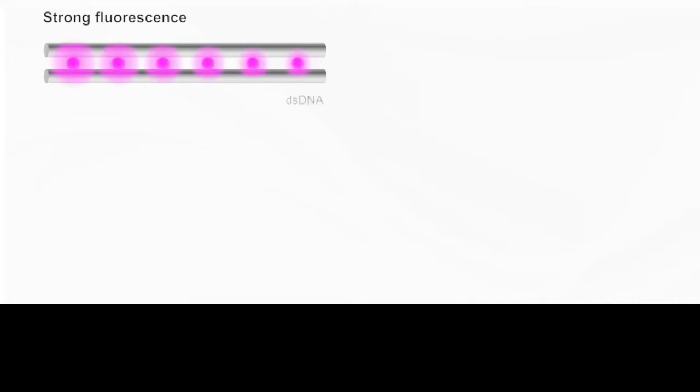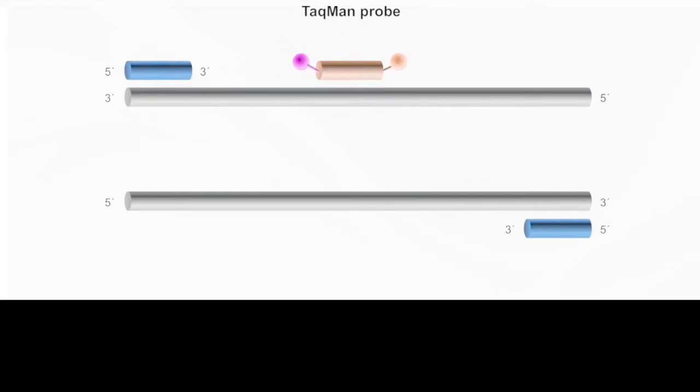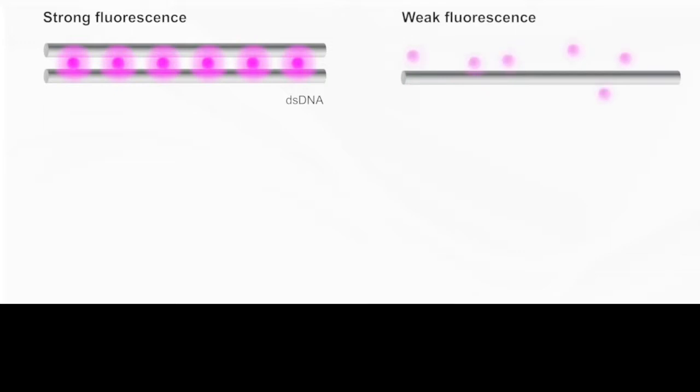So why would you want this kind of information? Well, for certain situations, for example viral infections, you don't just want to know whether the virus is present. Sometimes it's critical to know how much of the virus is present in the sample that you're analyzing. In certain diseases, it may be critical in determining whether you actually need to treat or you just observe and monitor the disease to see how it's progressing, because what is considered the viral load, how much of the virus is present, may be what's critical in determining whether you have a problem or you just have an issue that you need to monitor.